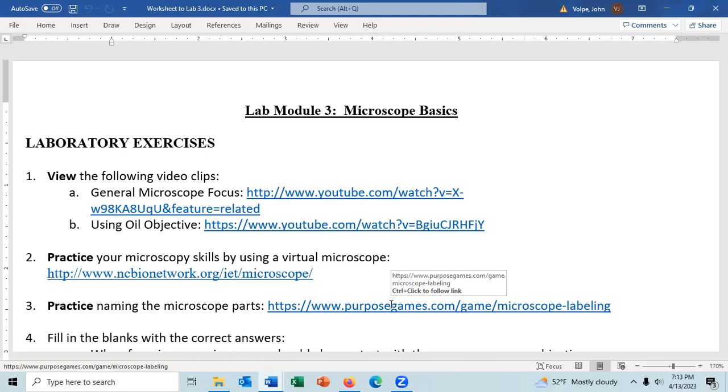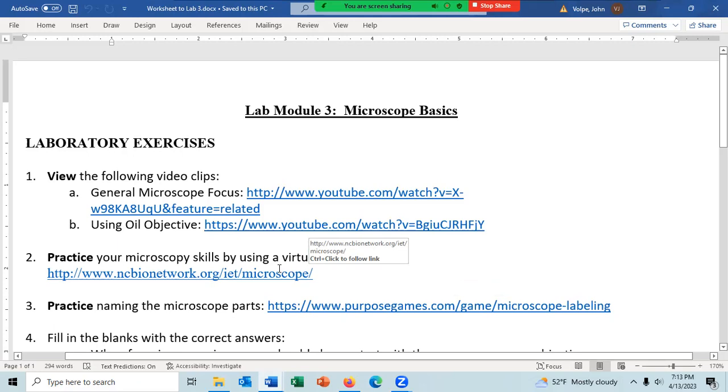So we have some video clips for you to watch on general focusing and then adding oil to the oil immersion slide and objective. And then practice your microscopy skills by using the virtual microscope. Let me see if that works. It does work on your copy. I'm not sure it works on my teacher copy.